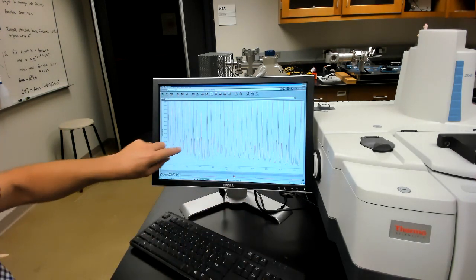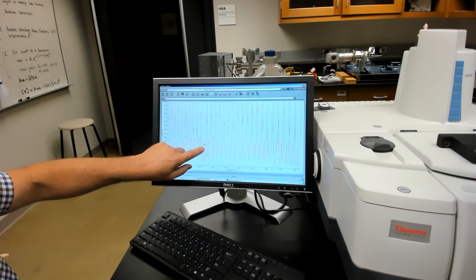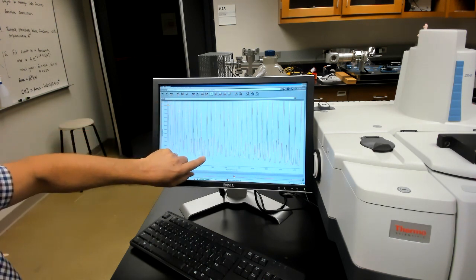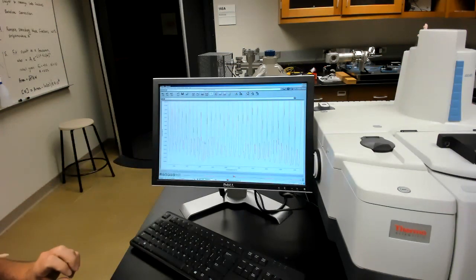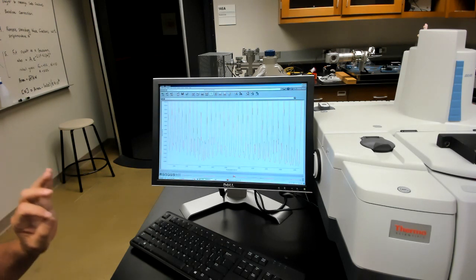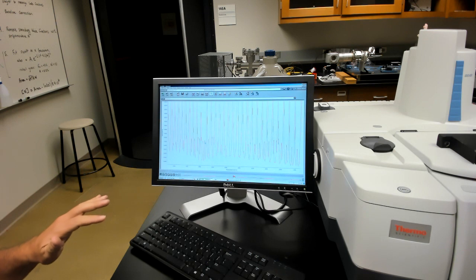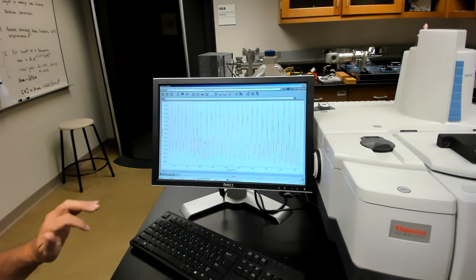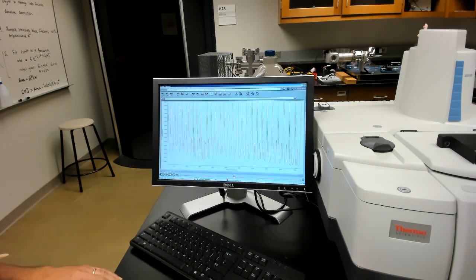Something really interesting about this set of lines, which is in the few places where we can see them unobscured by the main spectrum, like here and here, we can see that the spacing between the lines is 1/2 of the spacing between the main lines in carbon dioxide. There are twice as many lines in this spectrum as in the main spectrum. That's really interesting and something we'll want to think about, although it's not the main issue for our experiment.